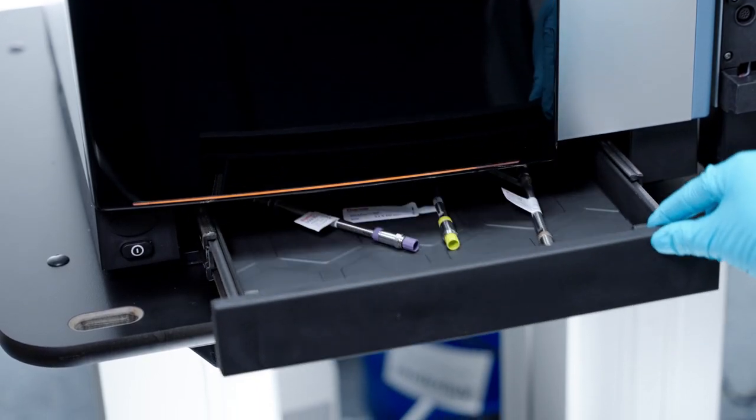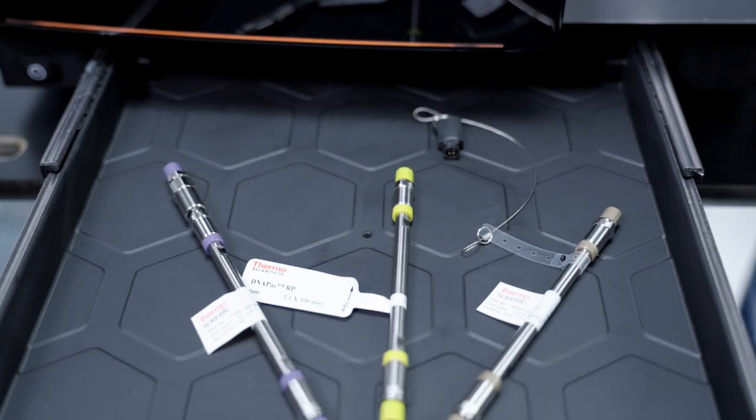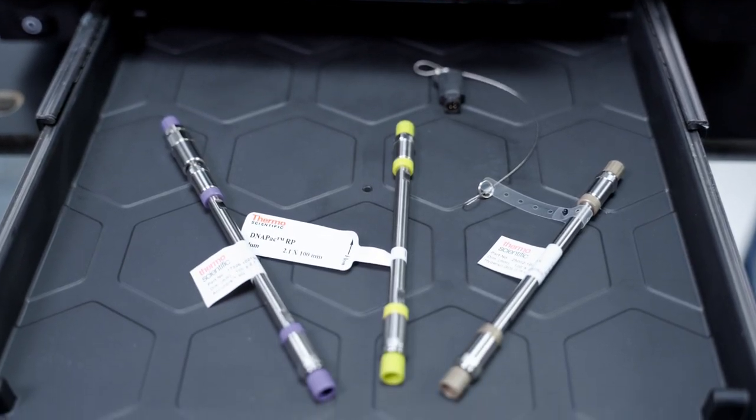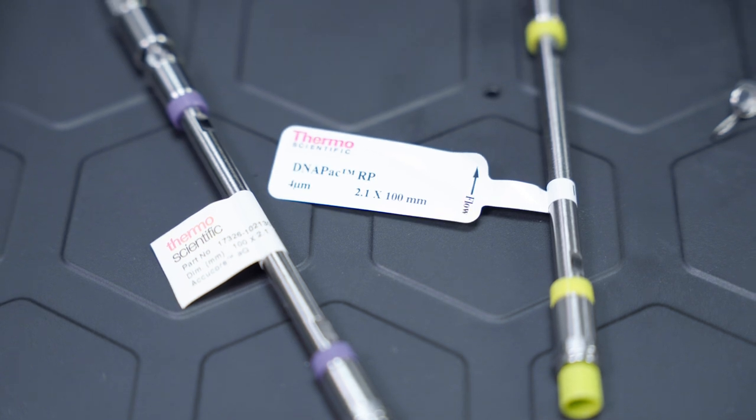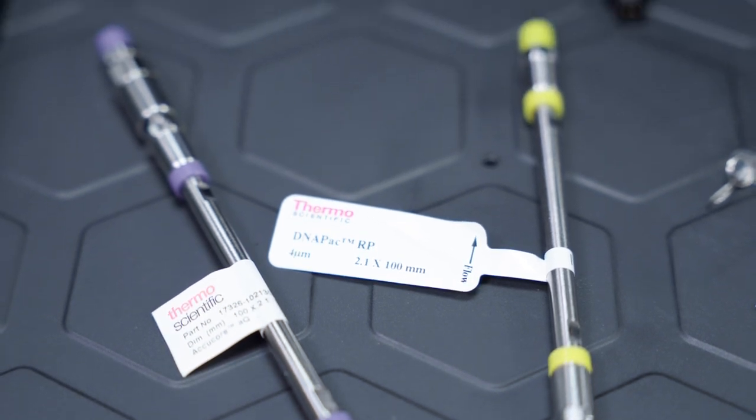At the center of every LC system is the column. The Thermoscientific Column Portfolio enables efficient separations from small molecules to a broad range of biomolecules.